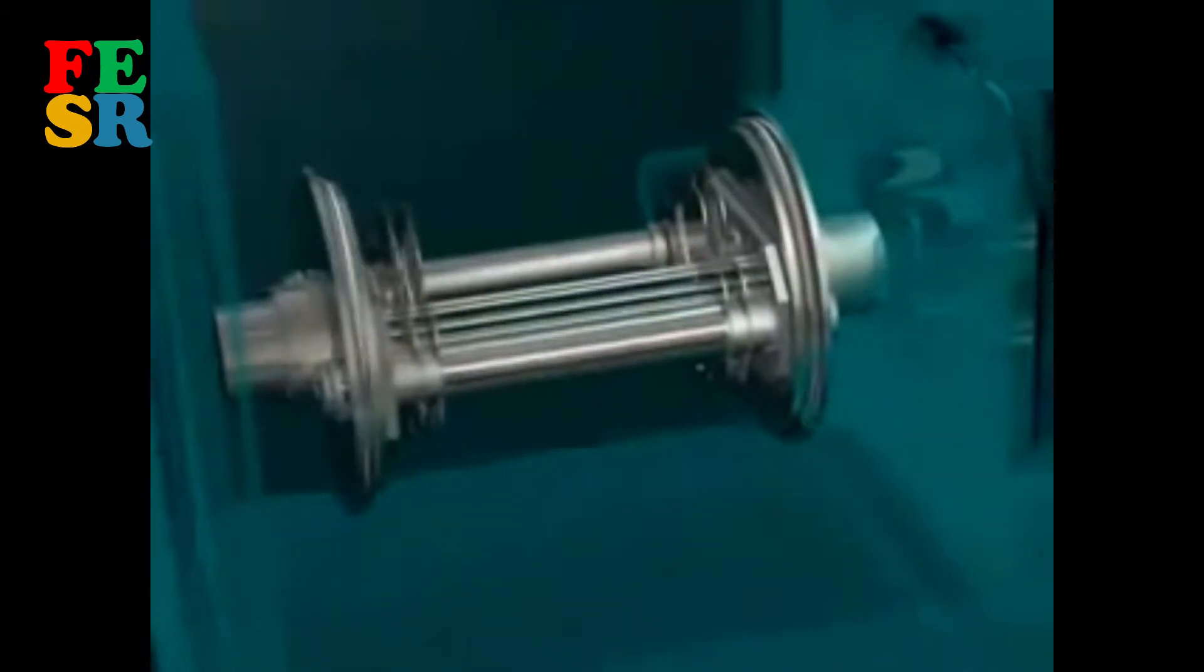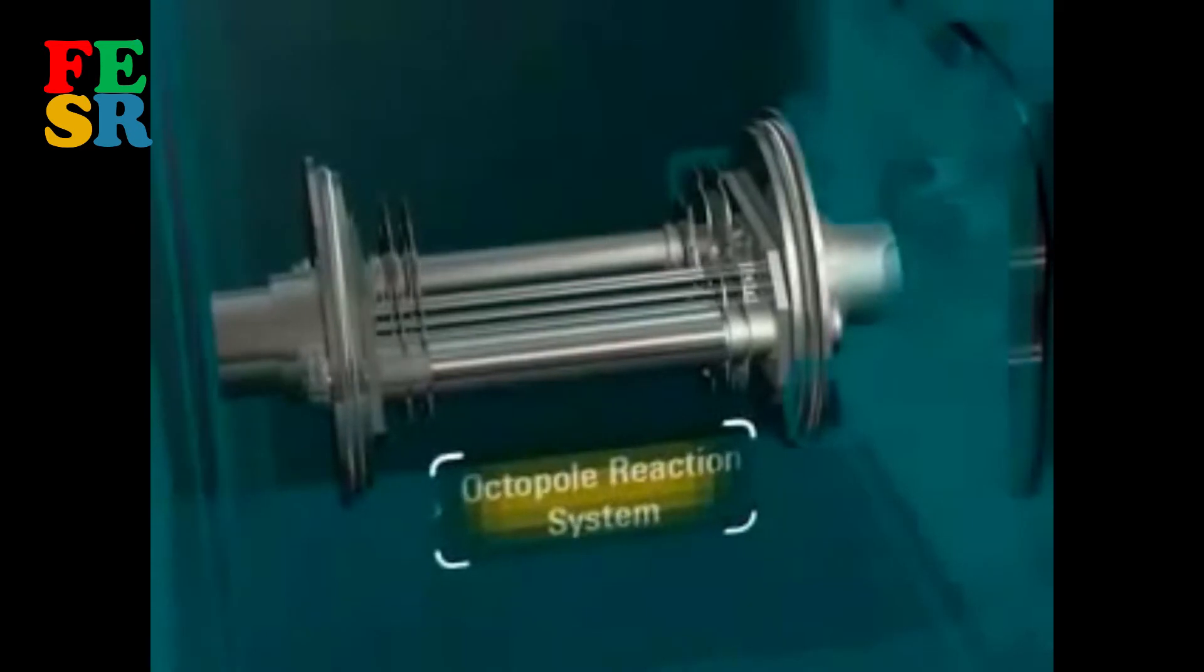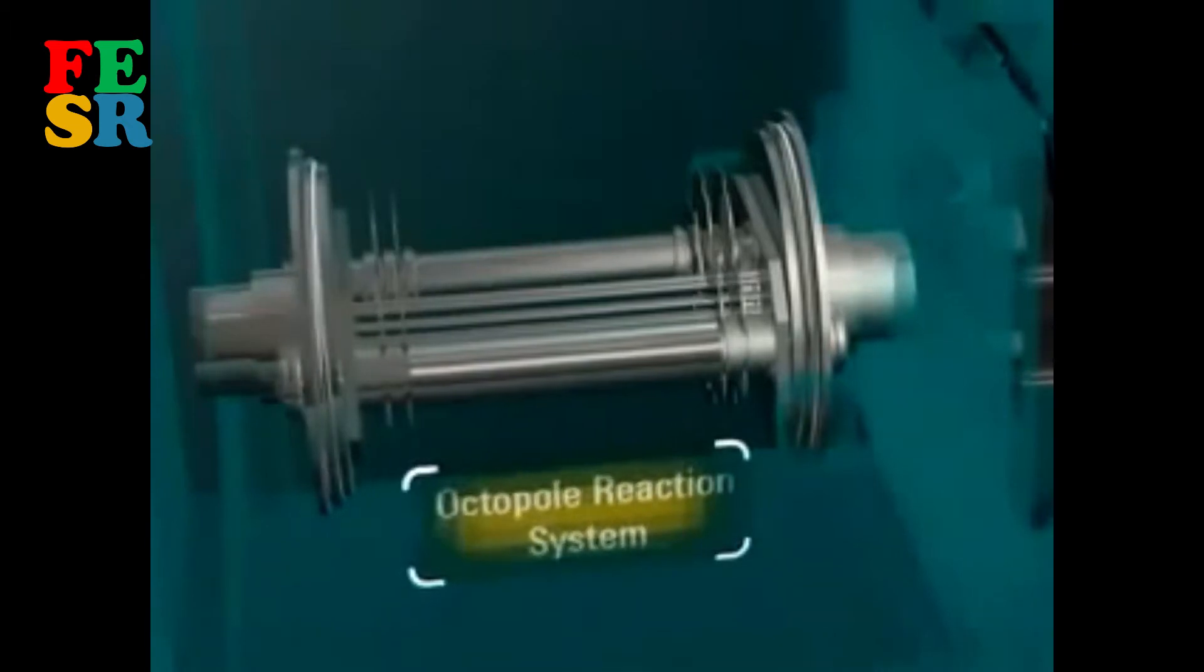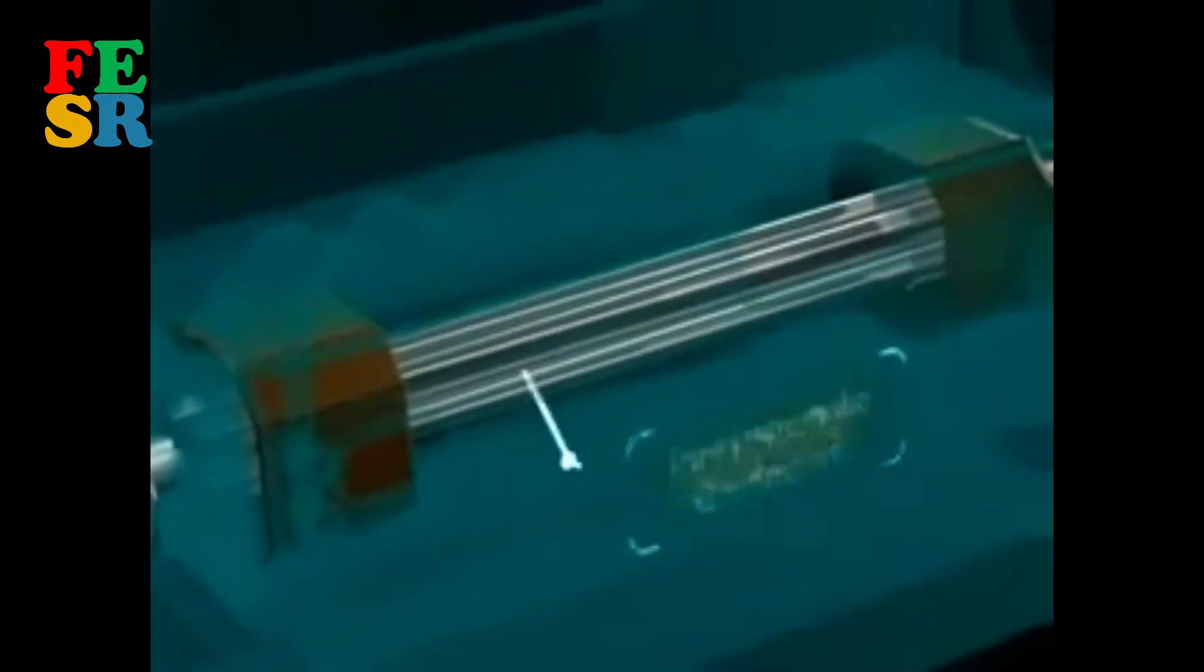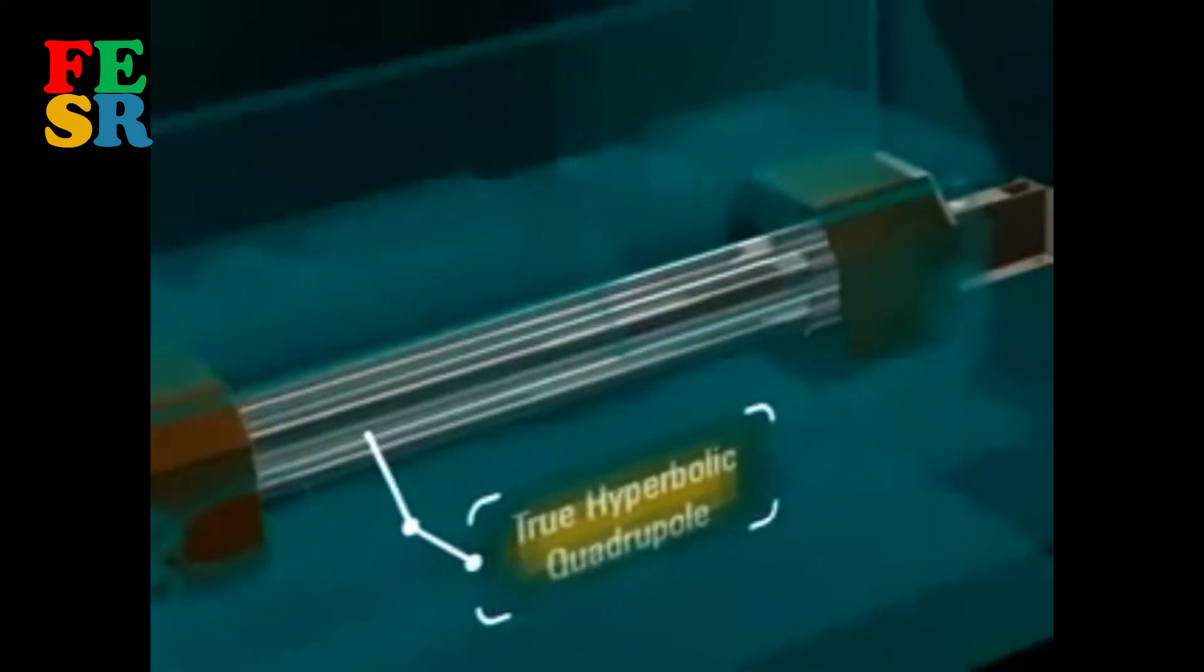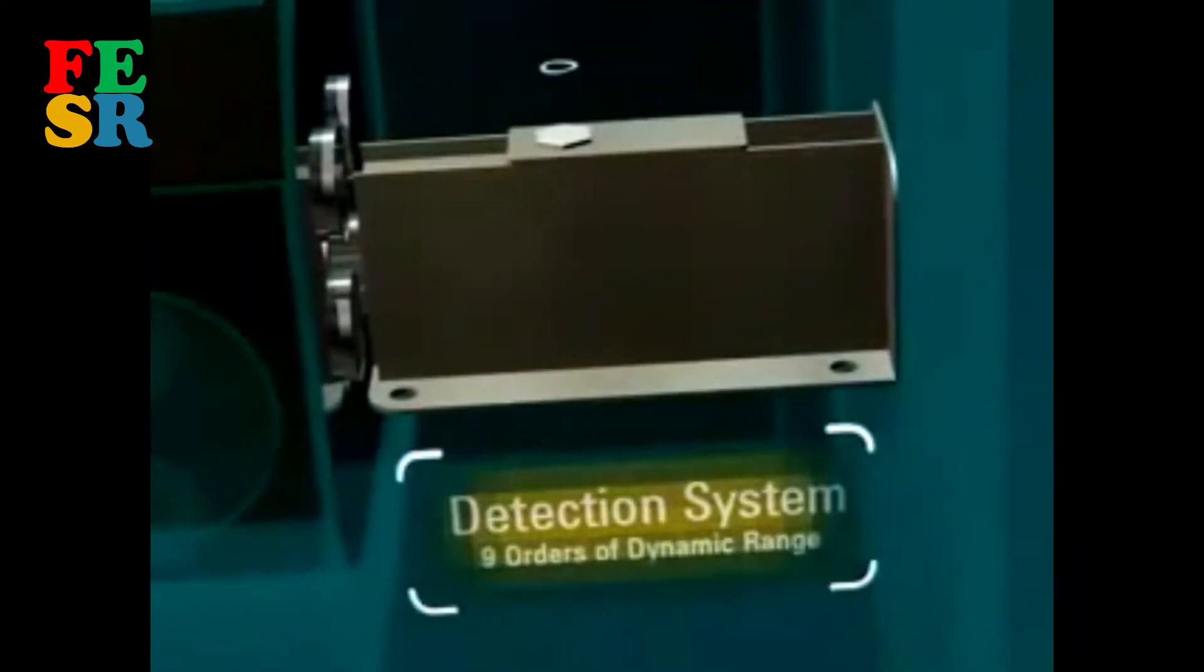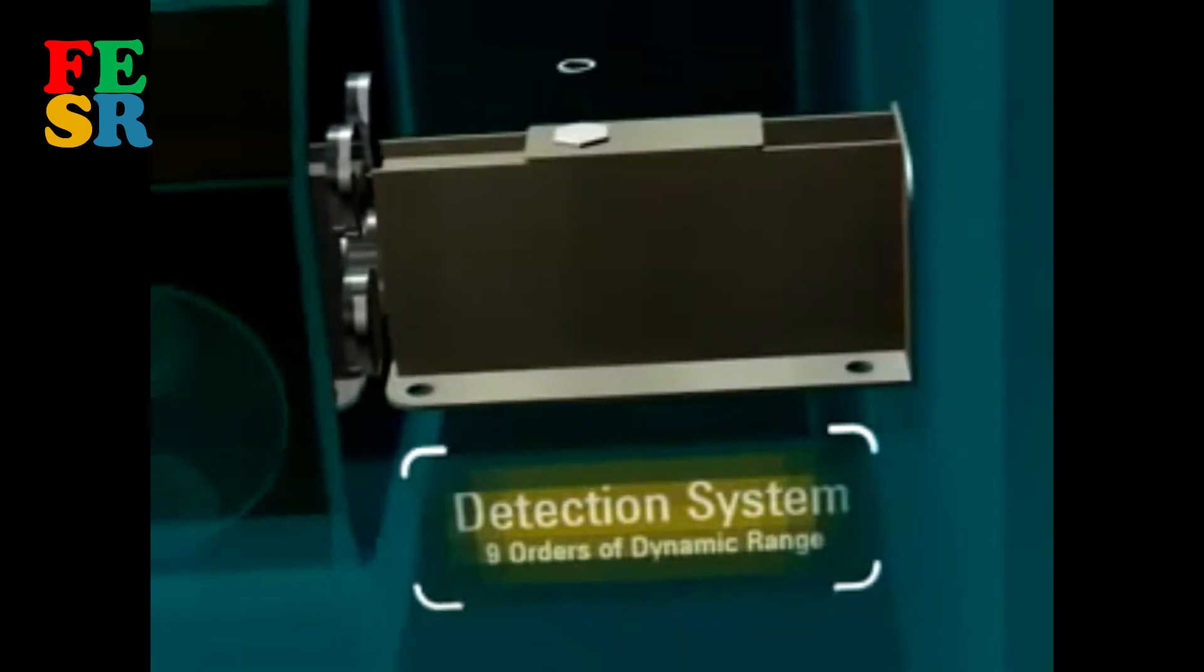The Octopole Reaction System is comprised of an octopole ion guide inside a pressurized reaction cell, and can be operated in both collision and reaction modes for the removal of polyatomic spectral interferences. Mass filtering is performed by a high-frequency quadrupole with unique true hyperbolic cross-sectional rods for superior abundance, sensitivity, and peak separation. The advanced detection system provides nine orders of linear dynamic range, from parts per trillion to hundreds of parts per million.